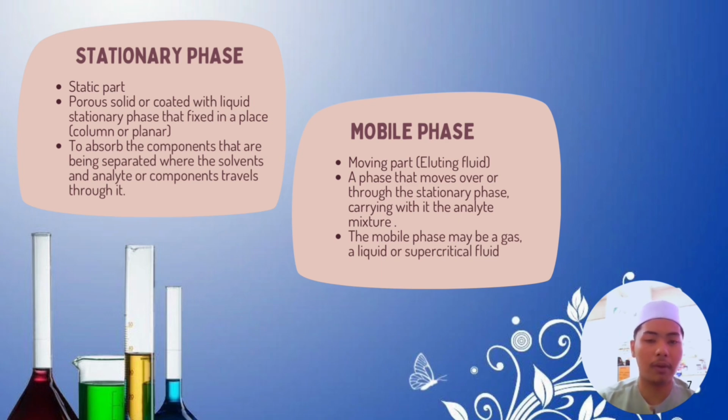Other than that, we have the mobile phase, which is the moving part, a phase that moves over or through the stationary phase, carrying with it the analyte mixture. The mobile phase may be a gas, a liquid, or a supercritical fluid.